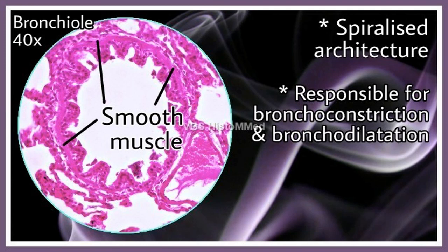The smooth muscle present in the bronchiole is a very signature feature. It appears circular in this photograph, but the point is this is a spiralized architecture — one or two layers of muscle running in spirals, with another group of smooth muscles running in the opposite spiral direction. So there are two spirals contrasting each other in direction, and this spiral architecture is responsible for bronchoconstriction and bronchodilatation.